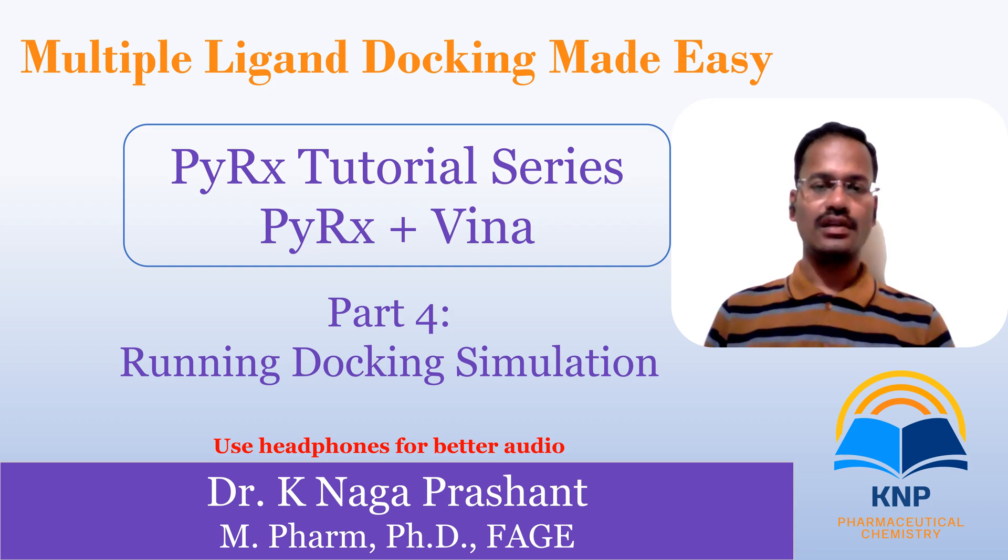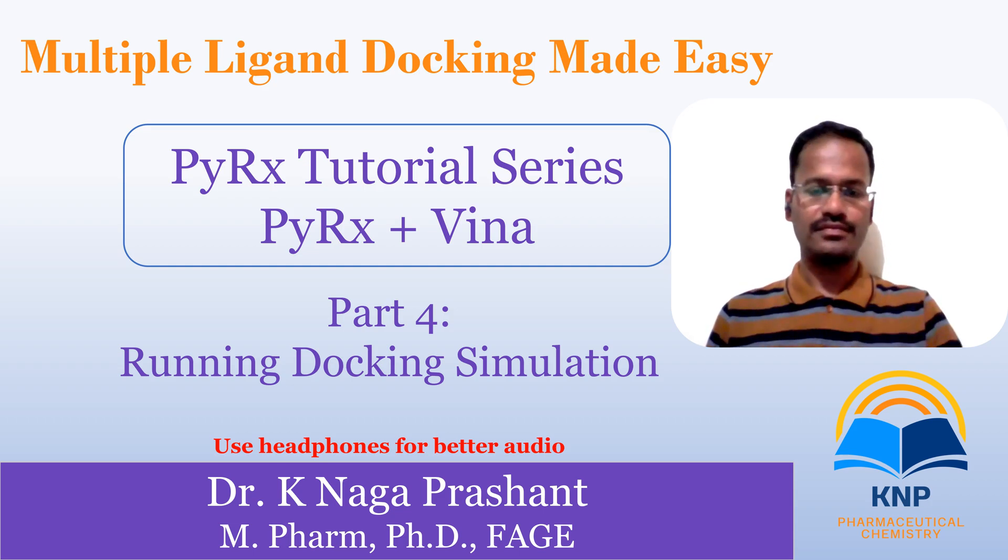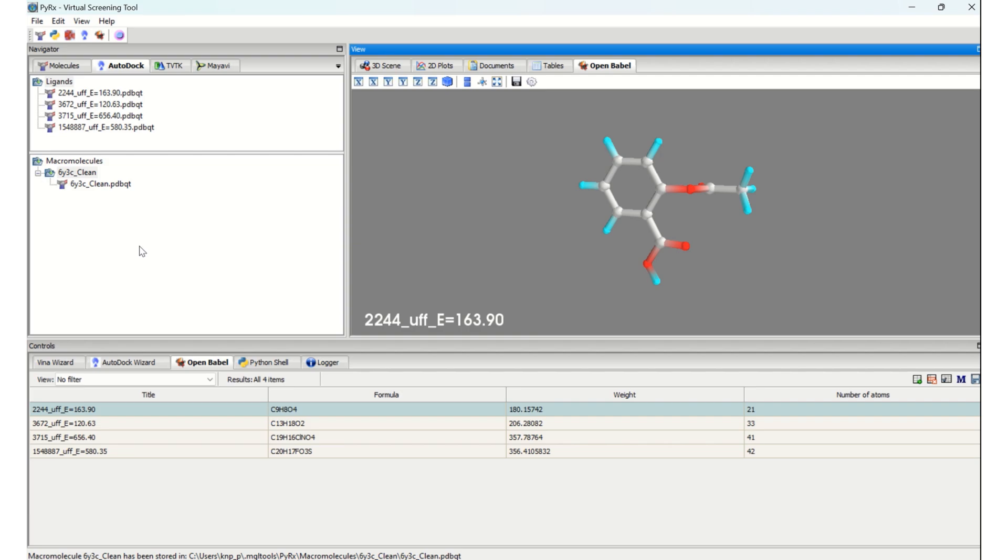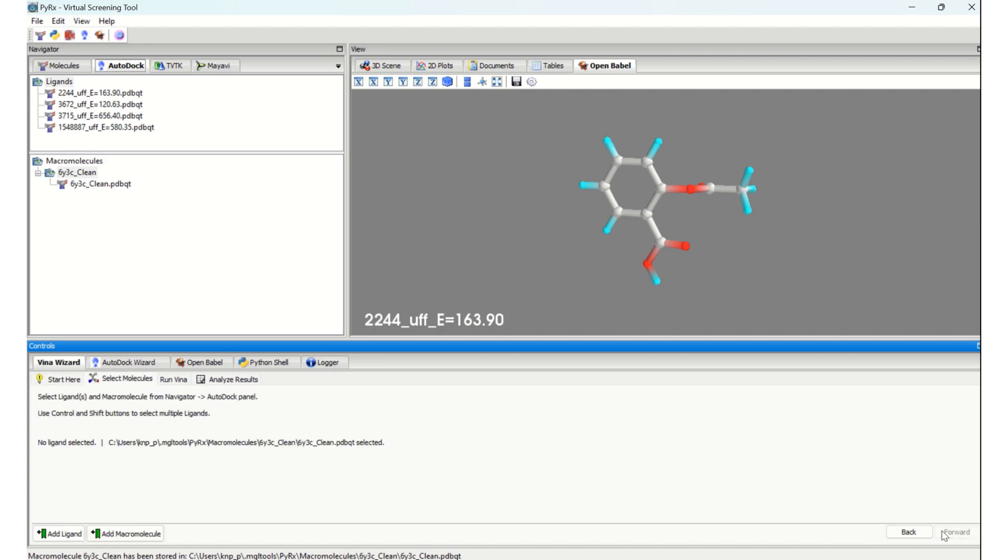Looking at the PyRx GUI, these are the prepared protein and ligands. Now we are going to see how to run AutoDock Vina simulation, for which we should go to Vina wizard and start by clicking this start button. Here, no ligands are selected, so we are about to start selecting our ligands.